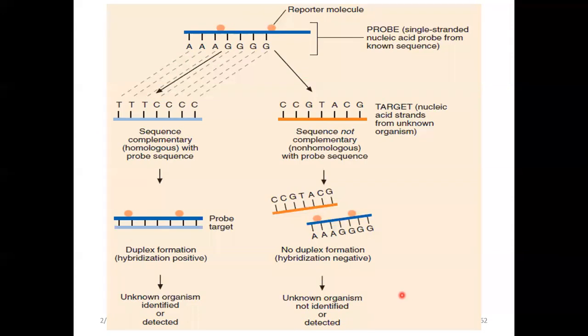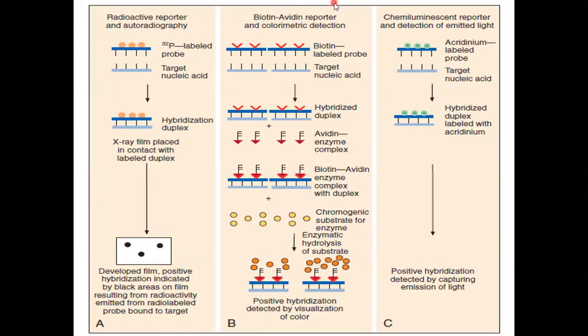Okay? So, guys, no, this one, you need not to memorize this, but this just only shows yung mga steps na ginagawa natin. Okay? So, we have here, guys, no, if you're using a radioactive label, okay, we use the result using autoradiography. So, we are reading the result just like an X-ray film. So, autoradiography, parang ganun siya. Okay?